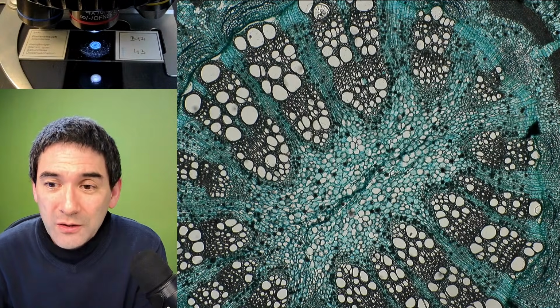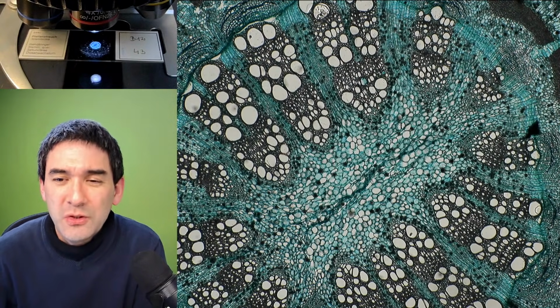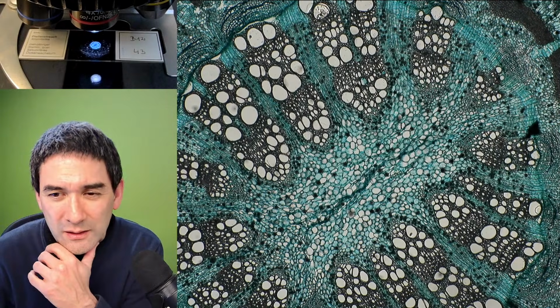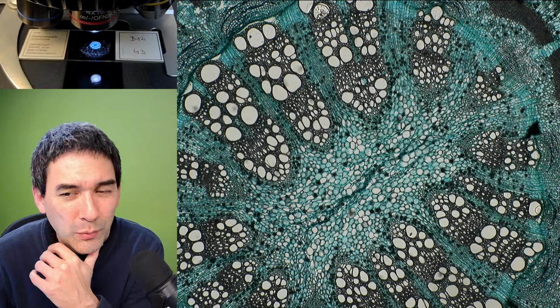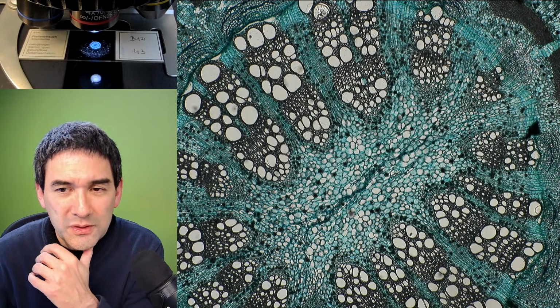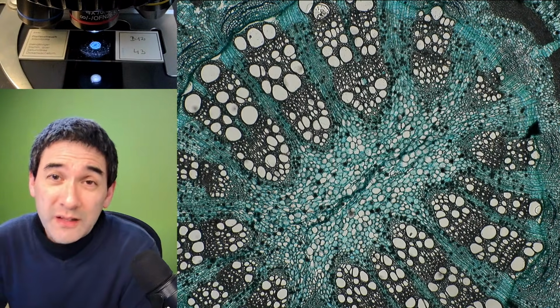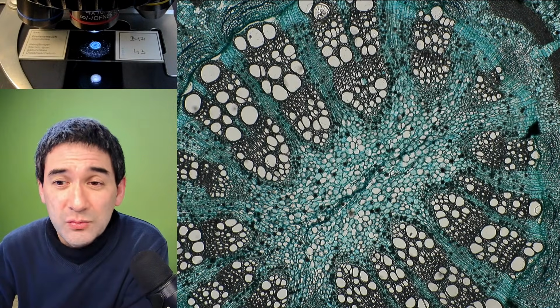Do you know anything about cleaning microscopes? I have a feeling lower end scopes like Swift, etc. need a good clean inside and out to get the best out of them, even if new. Honestly, I wouldn't clean them unless really necessary, and dust will always accumulate. My general advice is don't clean unless really necessary.